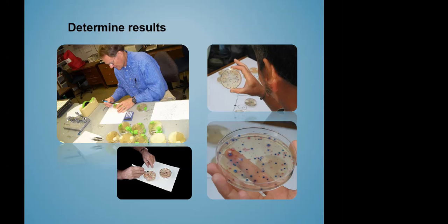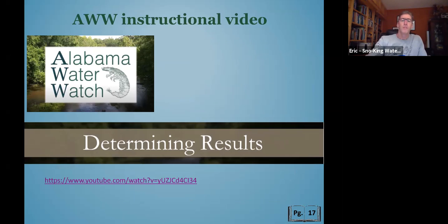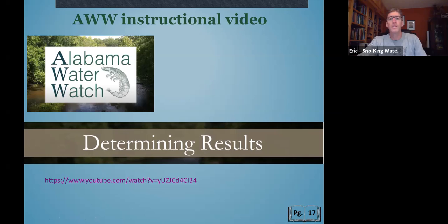Okay, so the next step. We collected our samples, we plated and incubated, then our next step is going to be to determine the results. So I've got another little video to show you guys on how to do that.